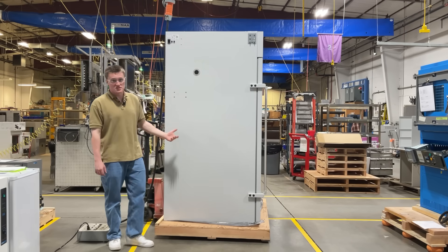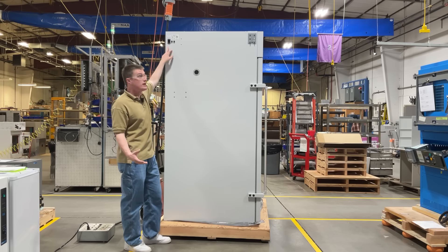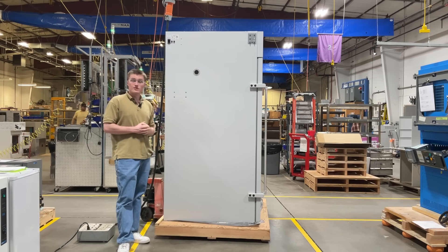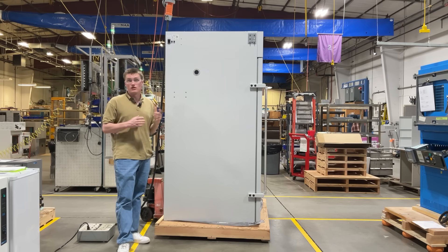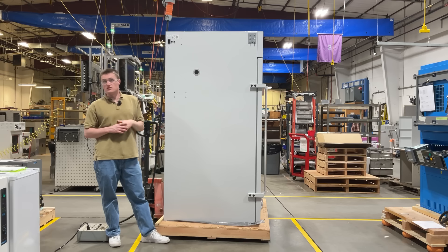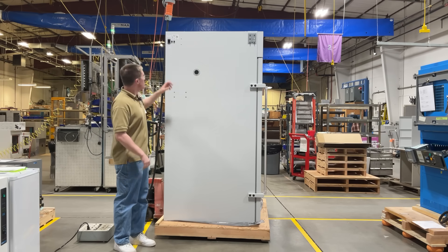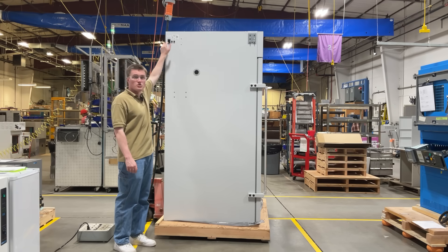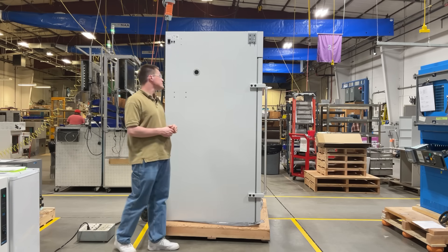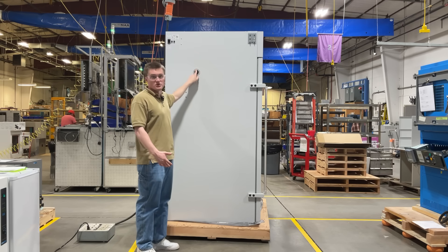Now let's take a look at some of the features on the left face of the unit. In the upper left corner, we have the main power inlet. Each unit comes included with a compatible power cord that must be connected to a properly grounded electrical outlet. For information related to electrical safety as well as installation instructions such as clearances, please visit your user manual. To the right of the main power inlet are two externally located fuse drawers for easy fuse replacement. On this side, as previously mentioned, is a one and three-quarters inch access port.